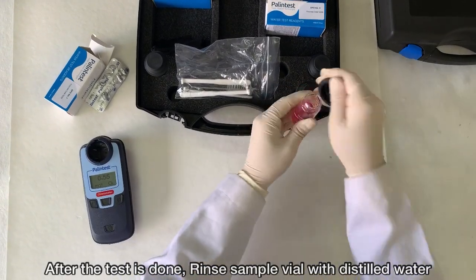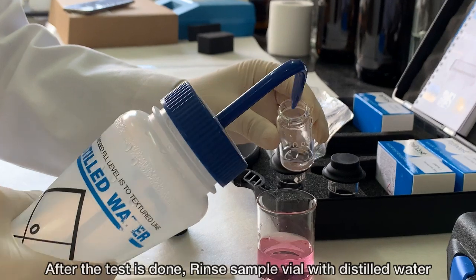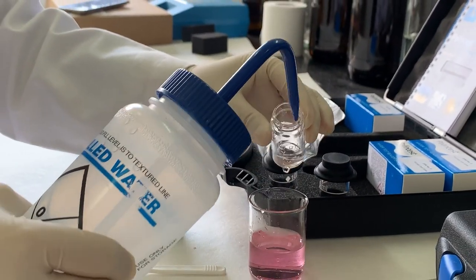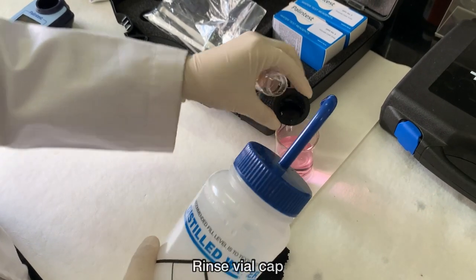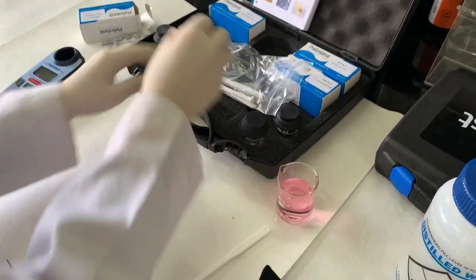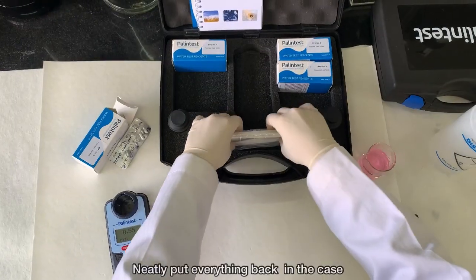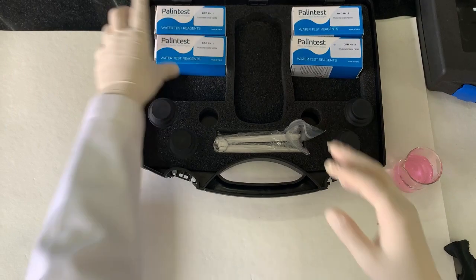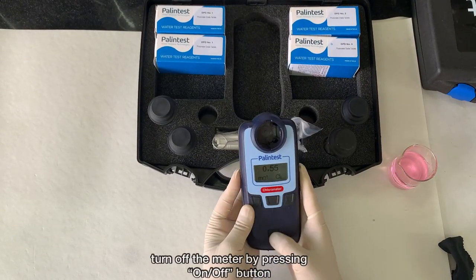After the test is done, rinse the sample vial with distilled water. Rinse the vial cap. Turn off the meter by pressing the on/off button.